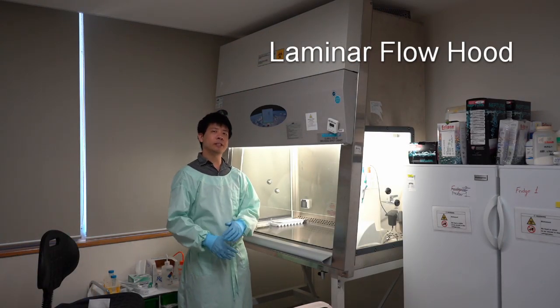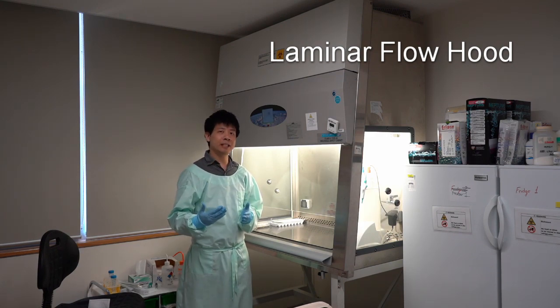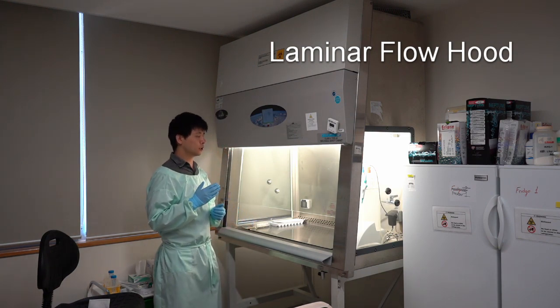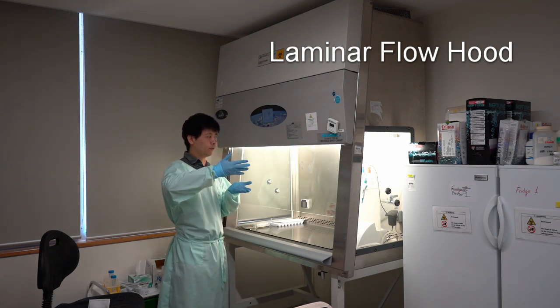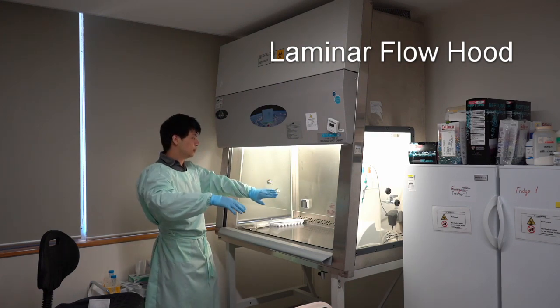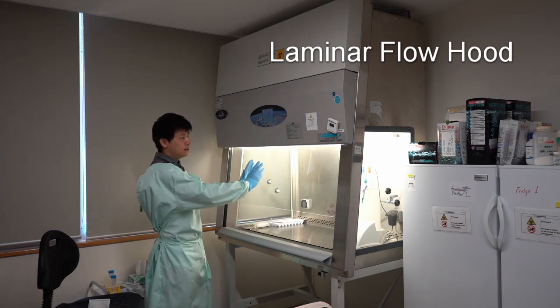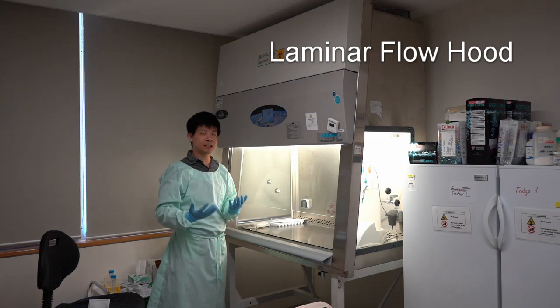When you perform cell culture, you need the cells to be in a sterile environment so that they are not contaminated by bacteria and viruses. We achieve this through a biological safety cabinet. The cabinet pushes air by laminar airflow from the top to the center and outwards to the sides into the grills at the back and the front. This air is then funneled back through HEPA filters at the top to remove any viruses and bacteria.